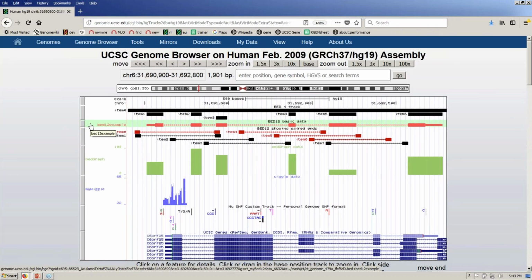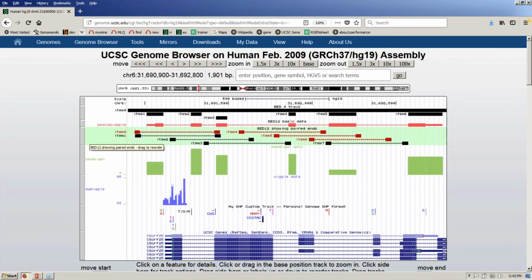And a more practical example these days, since most of our users are not creating gene models themselves, although you might if you were working on another organism that hasn't been well annotated, or if you were doing your own assembly hub. Bed 12 format can also be put into service for paired end sequencing, where you have a couple of reads at the end of the same molecule, and you want to represent how those molecules are displayed, and you can see how your sequencing looks, how much of the ends you've sequenced, and how well aligned they are to the genome.